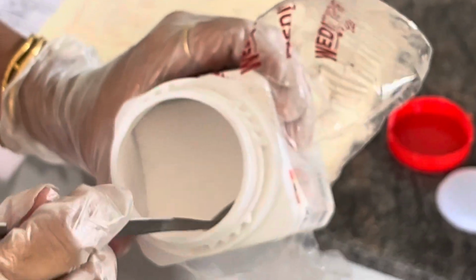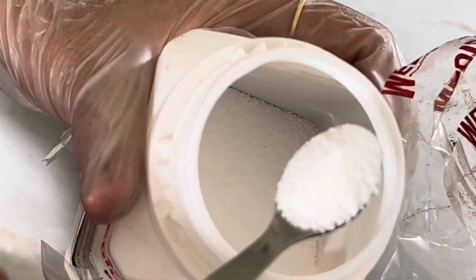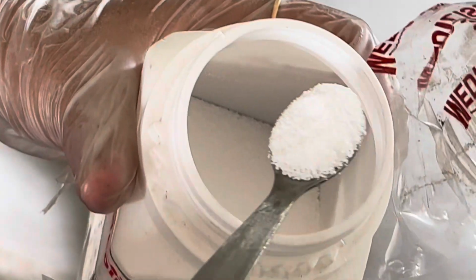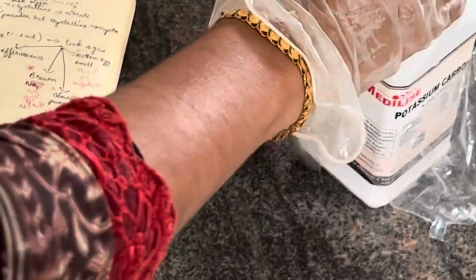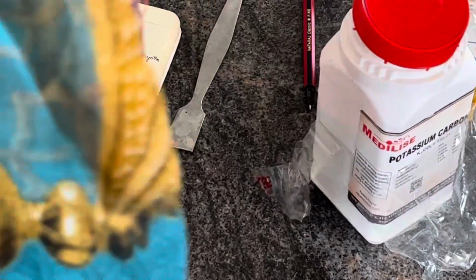So first of all, the first test is a preliminary analysis. In this preliminary analysis you have to test the physical state. See here, the given salt is a powdery type of substance. So in the physical state, if the salt is powdery, then it infers the presence of carbonate. So the salt may be carbonate.